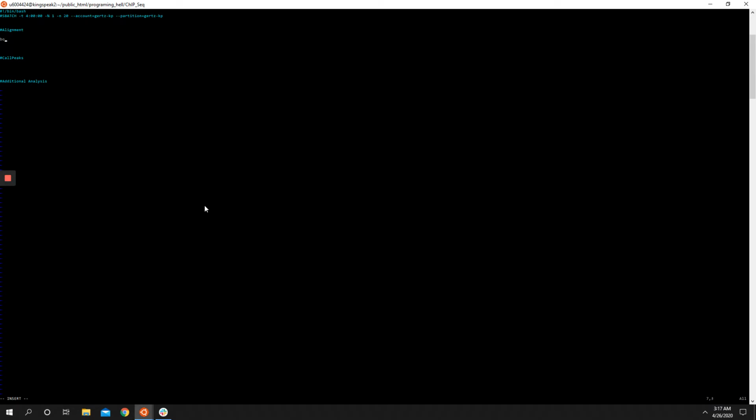Okay, so here is a Bowtie command. Let me retype this out. We'll just type echo. Echo is now going to spit this whole line out, and interpret variables. So let's talk about this.